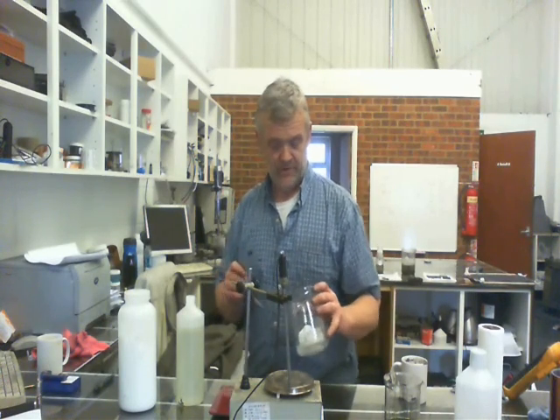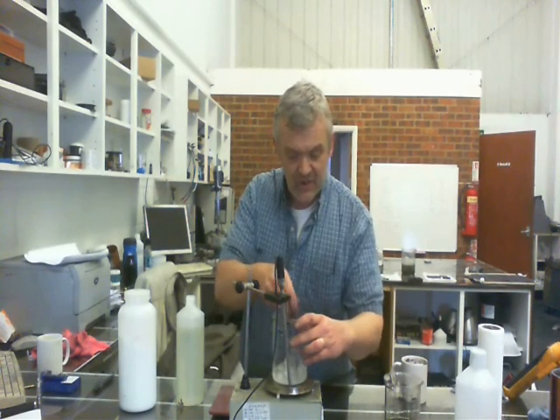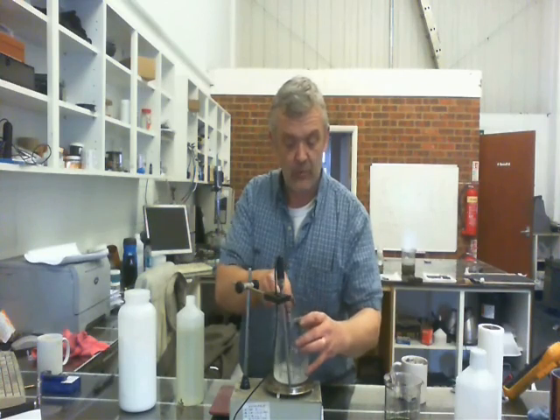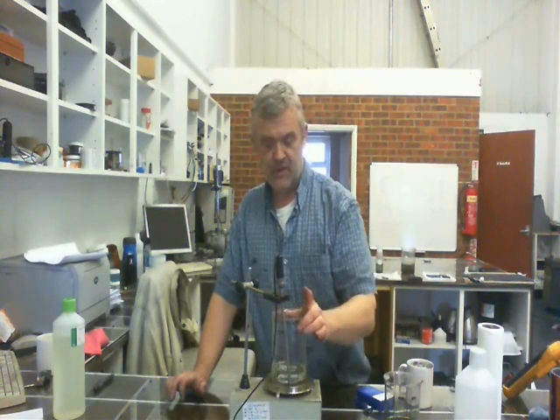This stuff won't dissolve all by itself — you need to heat it to about 80 degrees until it dissolves. As you can see, it's quite a thick, sugary consistency. As it heats and dissolves, it will just turn into a clear solution. Once it's dissolved, there's our deep eutectic solvent, all ready.